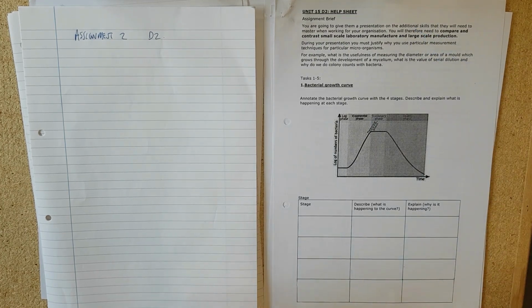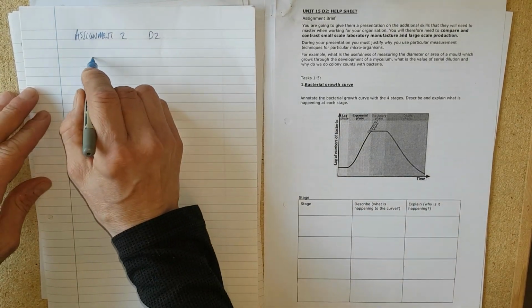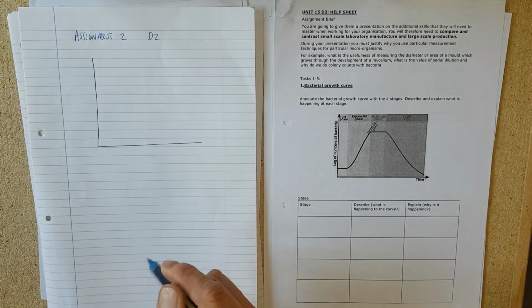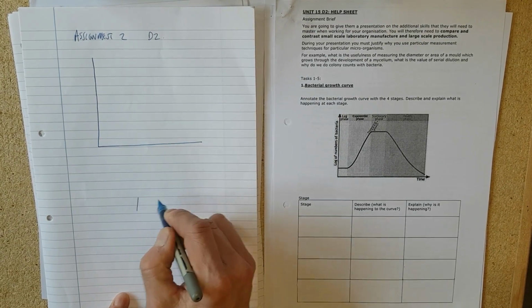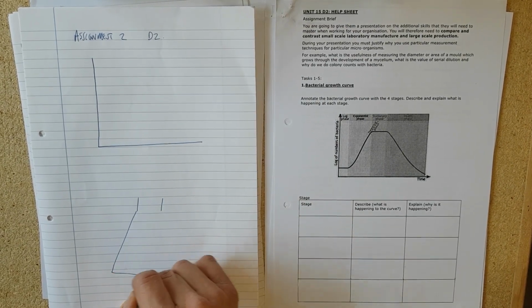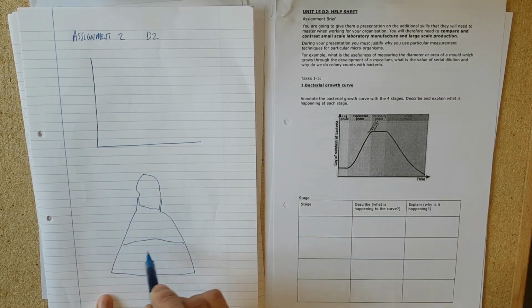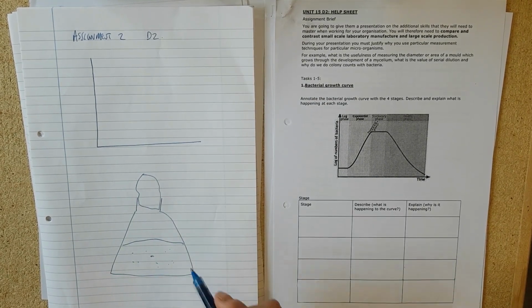So you've got this help sheet. I'm just going to fill it in and chat through it, then you can fill yours in. Right, so we've got a graph here. I'm just going to do a rough sketch of this graph and what it represents. So in your experiments, you saw, for example, a culture of yeast there. So we provided you with this culture of yeast.